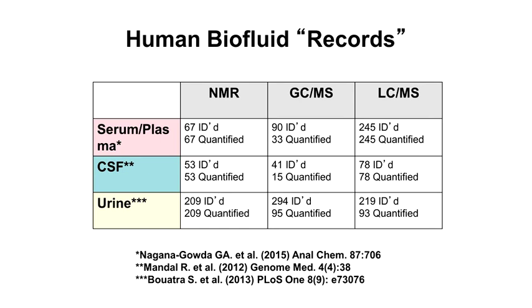And in urine, actually, NMR still holds sort of the records in terms of completeness for both identification and quantification. Now, that said, each of these technologies measures a different part of the metabolome. So it's not as if these are all the same compounds. Sum these together, and you might only find about a 10% overlap between each of the methods. So again, one shouldn't be done to the exclusion of the others. And in our routine work, we always use all three technologies.